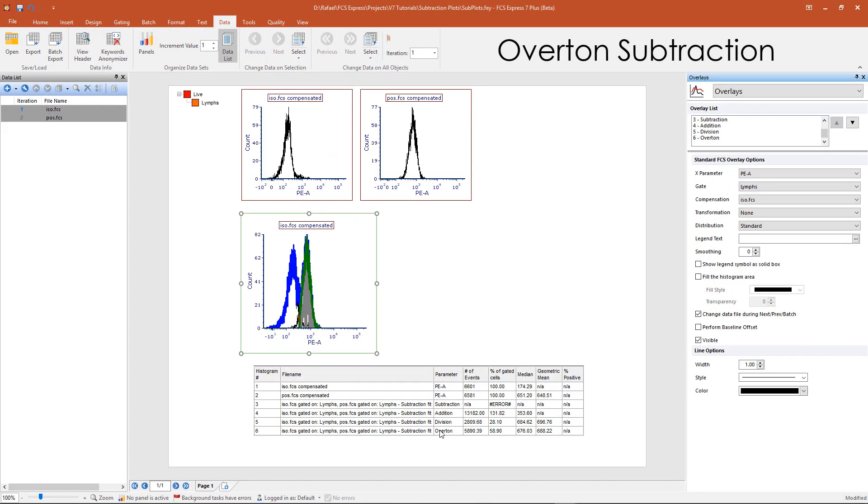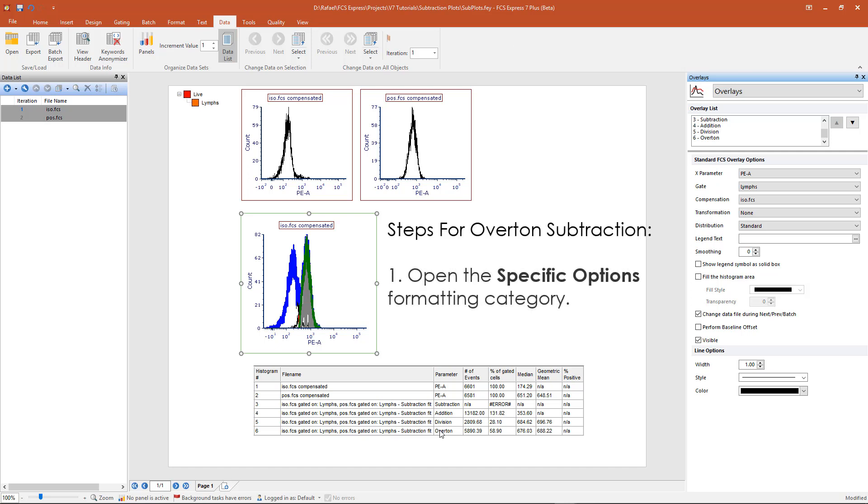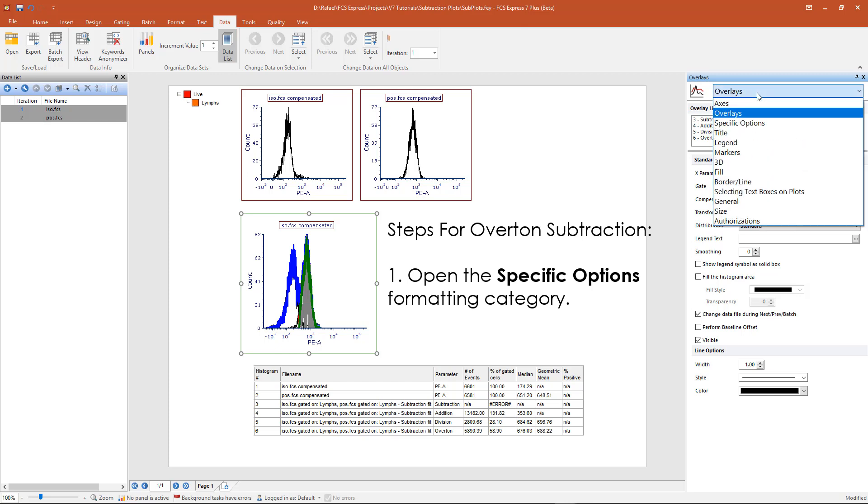In this example, we will be using overton subtraction method to calculate the percentage positive on our subtraction plot. Overton subtraction is the default method for histogram subtraction and is set by selecting the appropriate negative control histogram in the specific options.